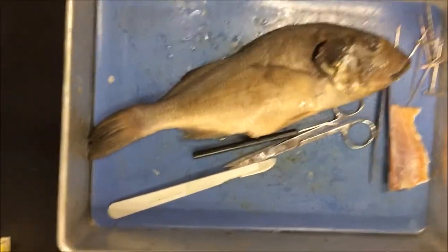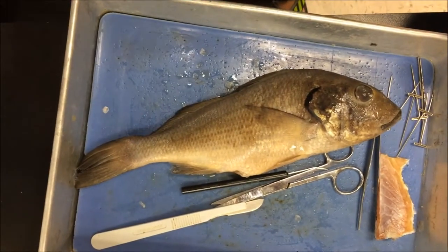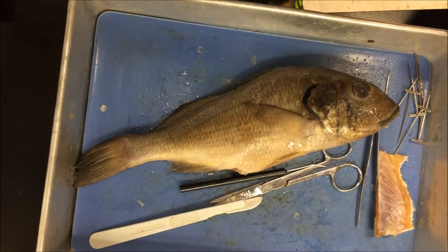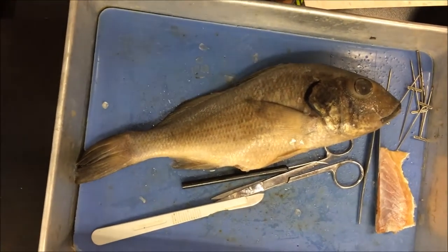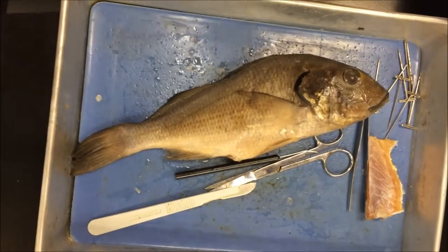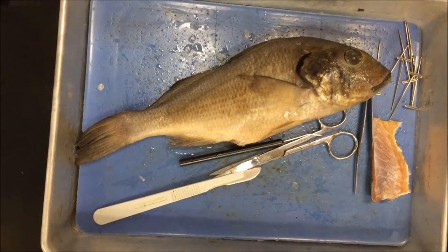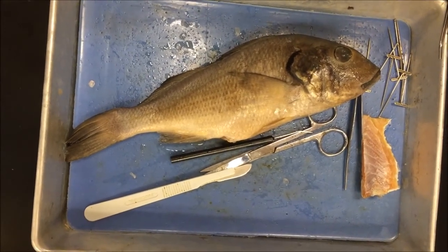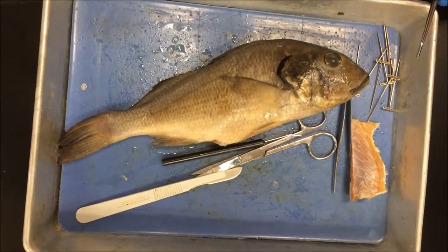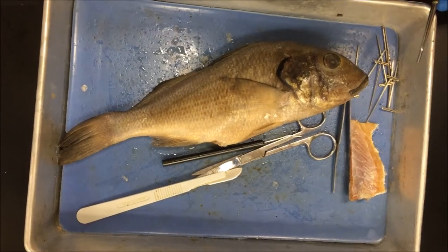We have a perch here and it belongs to Phylum Chordata, Phylum Vertebrata, superclass Gnathostomata, which is a fish that has two jaws, unlike a lamprey which doesn't have a jaw. Its class is Actinopterygii, which are ray-finned fish, and genus Perca — perch.